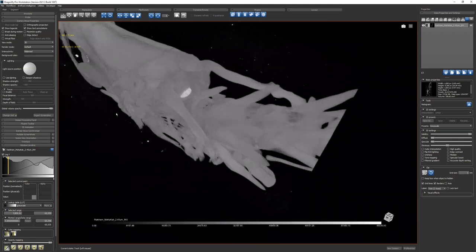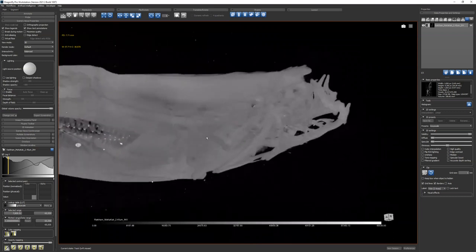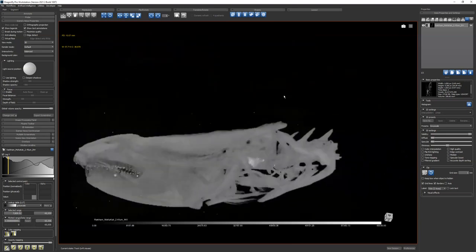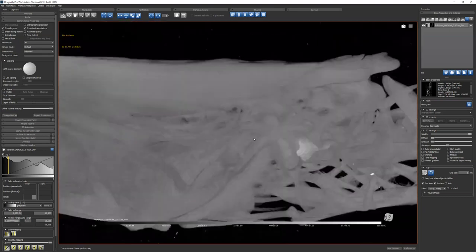So we can decide, and by we, I mean Ralph can decide which bone or region we want to do first, and we will go through that. Well, we should pick one that is relatively easy. So maybe the neurocranium. Okay. Because if you do the palate or jaws, you have to deal with the teeth, and that might get complicated. Right? Yeah. So let's see where we are at.